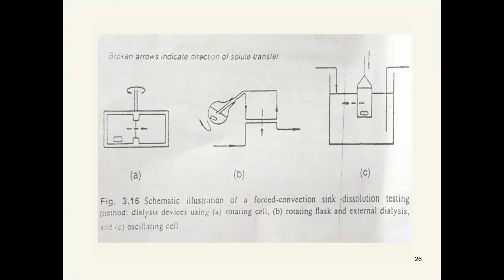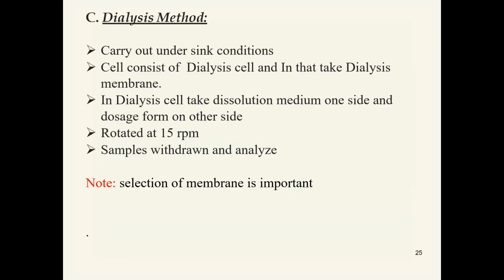The membrane must have a short equilibration time and adequate physical strength, and it must also retain solid particles. This is about the dialysis method.